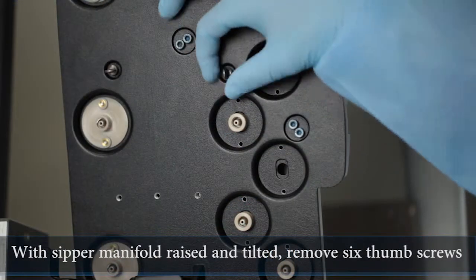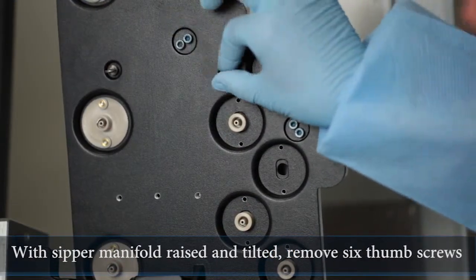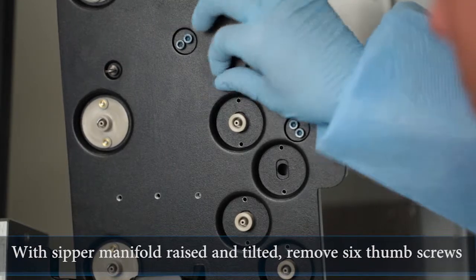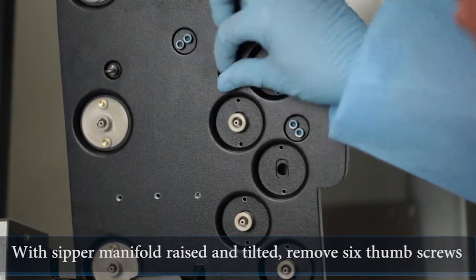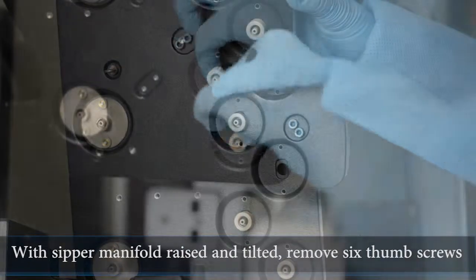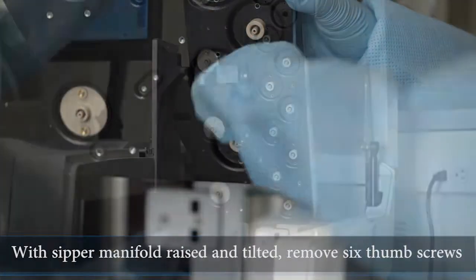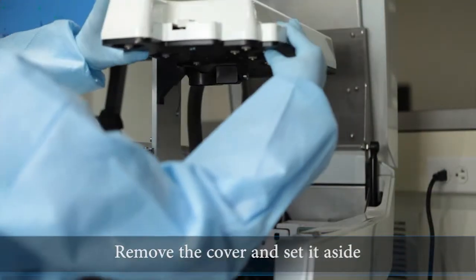With the sipper manifold still in its raised and tilted back position, remove the six thumbscrews that hold the manifold cover in place. Then remove the cover and set it aside.